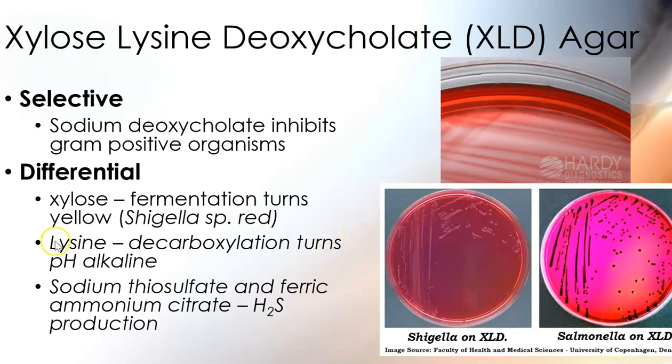It's a long day. So, lysine. One of the things that we look at all the time is lysine decarboxylation, arginine decarboxylation, and ornithine decarboxylation. So ornithine decarboxylation is one of those tests that we set up this week in the MIO media, the purple media. Find out if they're taking the carboxyl group off of the end of this amino acid. It's terrible. And then the H2S production, look, sodium thiosulfate and some sort of ferric something or other, right? There's always iron to make the black stuff. Thiosulfate has the H2S production.